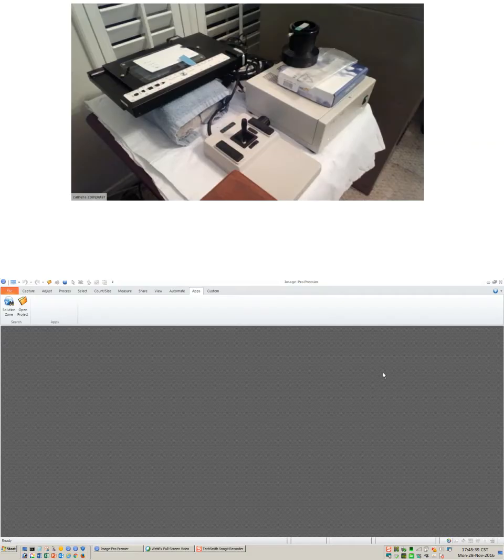At the top of your screen you can see a live video of the PRIOR X, Y, and Z components. The X and Y are represented by the stage on the left, and the Z is the drive that's in the upper right hand corner.